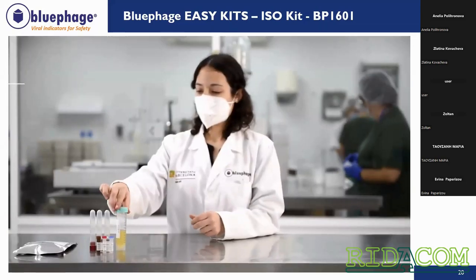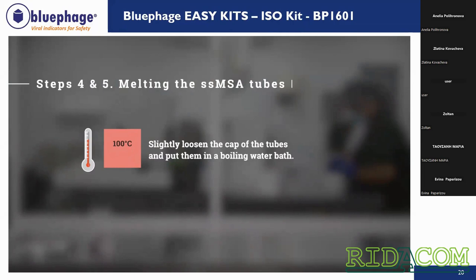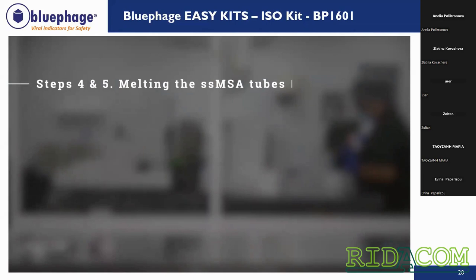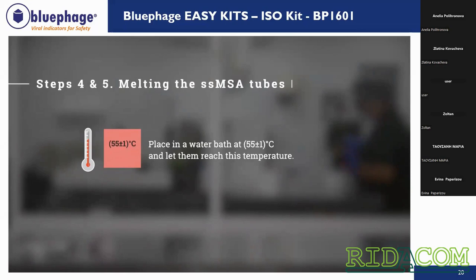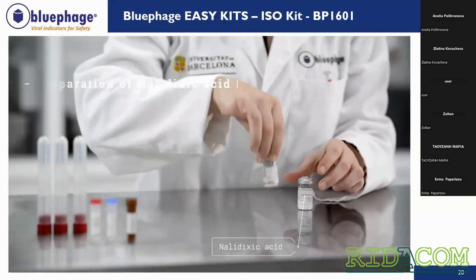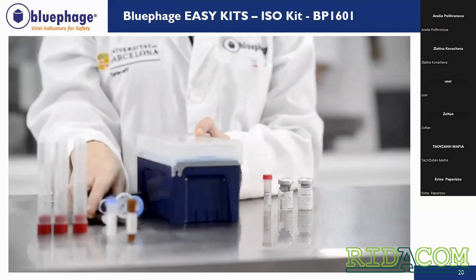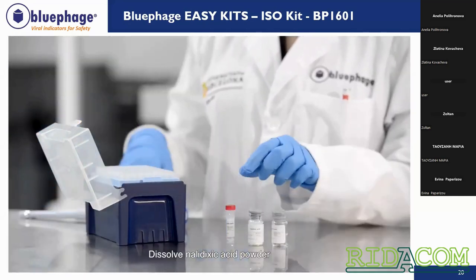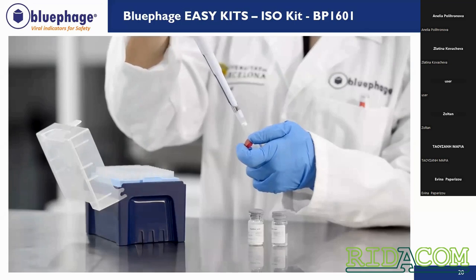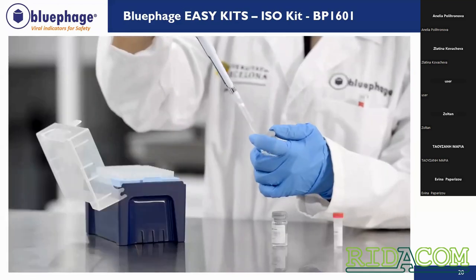In the meanwhile, our inoculum culture is in the incubator, so we can start preparing the samples. First, we need to melt the semi-solid MSA in the boiling water bath. It's really important to check that the agar is completely melted before it's used. Once it is melted, we will place it in a water bath at 55 degrees and let it reach that temperature. Meanwhile, we will prepare our nalidixic acid. We have a vial with powder nalidixic acid, water, and sodium hydroxide. We will use 0.6 mL of the sodium hydroxide solution and add it to our vial of the nalidixic acid powder.